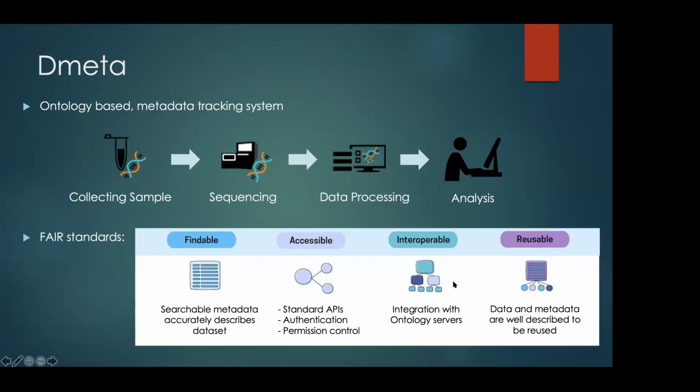And we also created more interoperable and reusable metadata that people can access, that is well maintained, and that is described with descriptions. When people go there, they can actually understand and reuse the data. This is the actual goal.